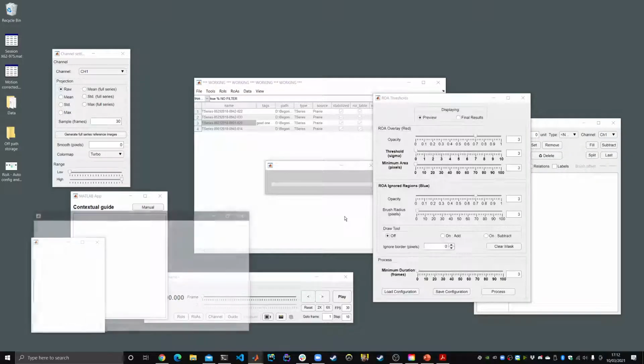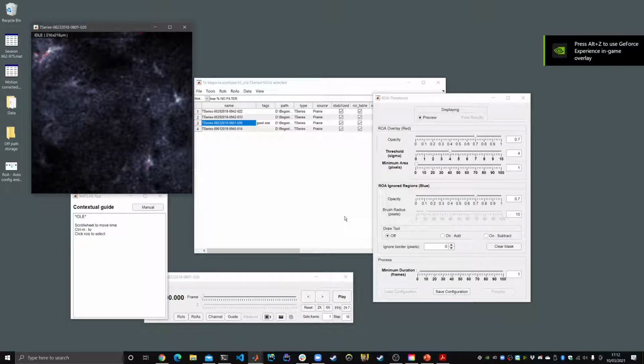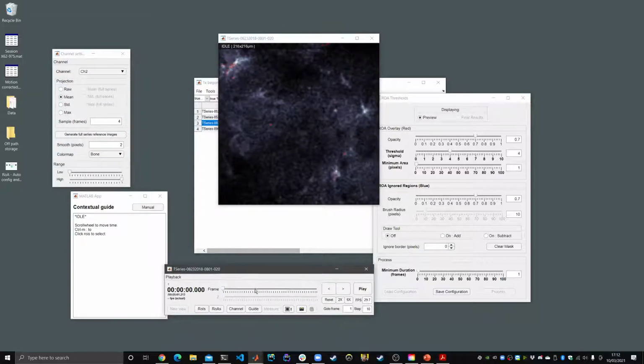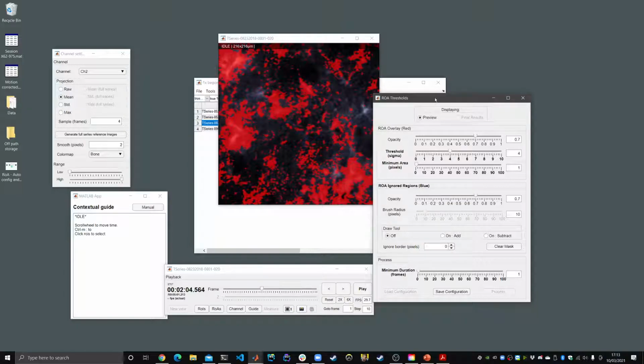So what we've done so far is we let the computer decide the appropriate pre-processing necessary, which means temporal and spatial smoothing that pushes the signal to noise ratio up to 9. So what you're looking at in this window right now is effectively the data after it has been processed in this fashion. What we need to do next is determine the threshold above which the signal is perceived to be real signal.